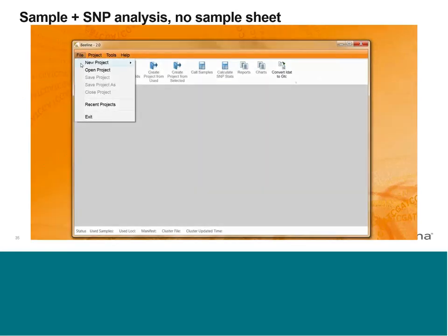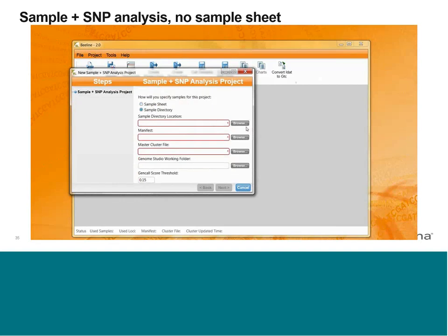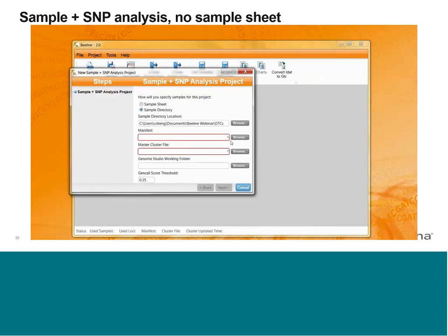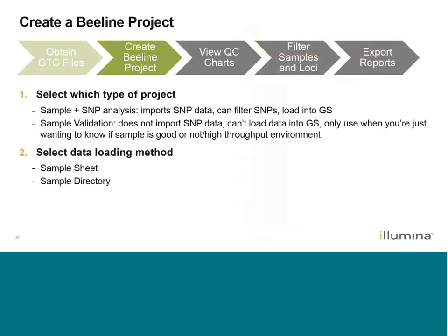Here's an example of creating a project with a sample sheet that has the path column. I create a project, locate my sample sheet — the path is already in there, so I just put in my manifest and cluster files. There are just 12 samples, so it's pretty fast. It loads the cluster positions from the cluster file, and at the end I have my 12-sample project containing all the loci information. You can also toggle to sample directory and select where your GTC files are stored, then put in your manifest and cluster files to complete project creation without a sample sheet.